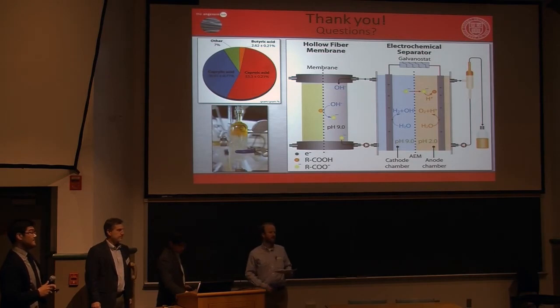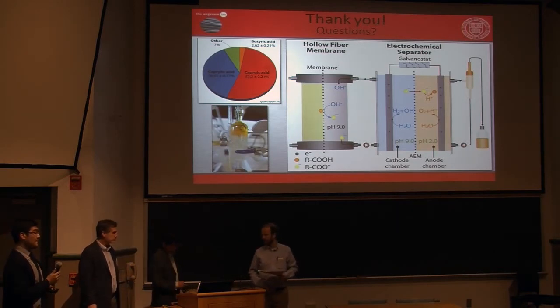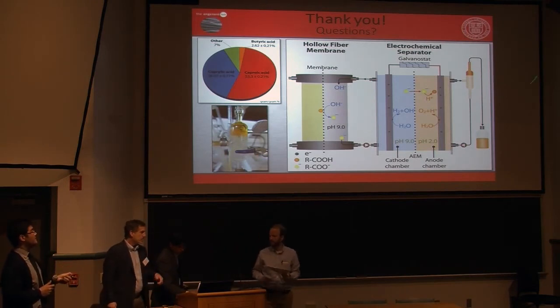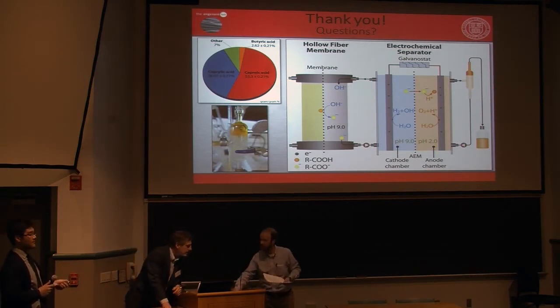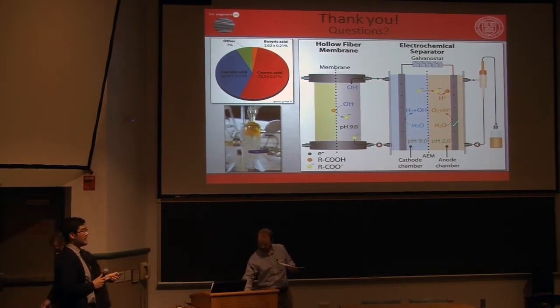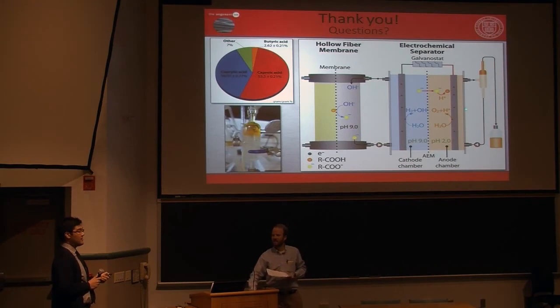Because the product is generated by electrochemical reaction, anything that comes off from the product is from the electrochemical process. So this anode chamber is at max solubility, so we're not getting any more accumulation there. The only new product, and the only thing we see coming off of the reactor, is whatever is electrochemically driven to leave from the cathode.